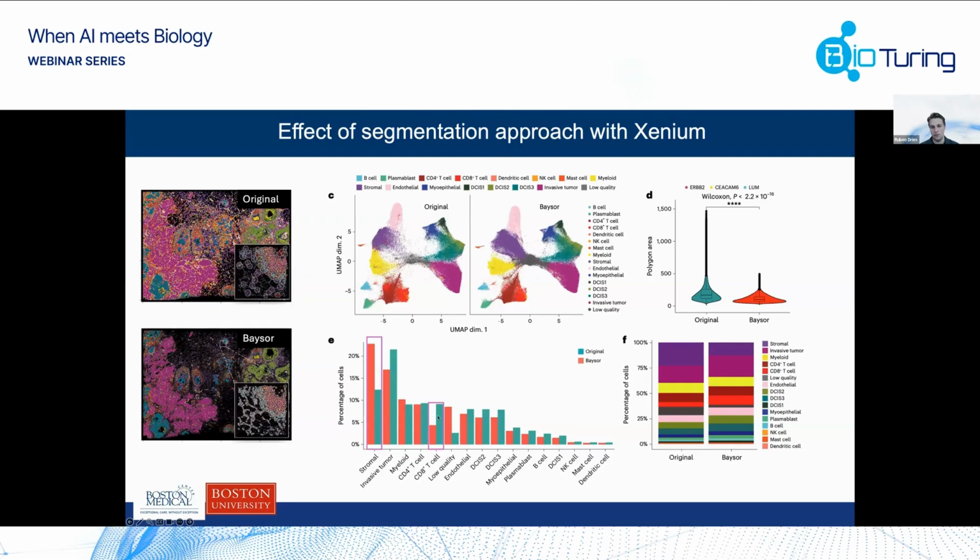In breast cancer, there are two really important cell types where there's a lot of research, or actually more, but definitely the cancer-associated fibroblasts and CD8 positive T cells, which are really important. And so having that accurate, or thinking about what is my most accurate representation, really matters if you would like to do any type of downstream analysis and make conclusions that are based on the real data.